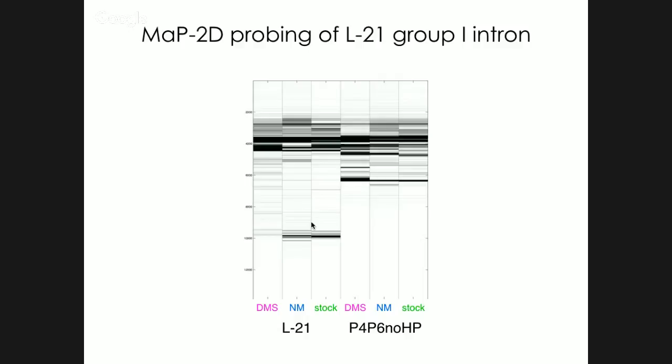Oh, cross our fingers. If it doesn't look fine, you need to purify out the full-length product, a kind of size selection. Yeah, that's great.